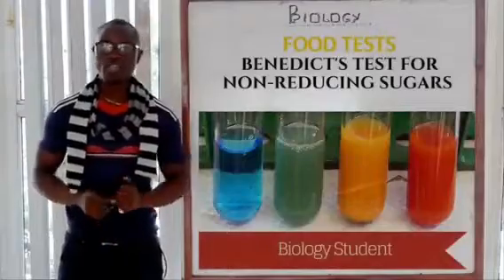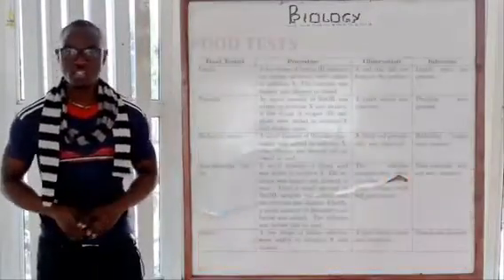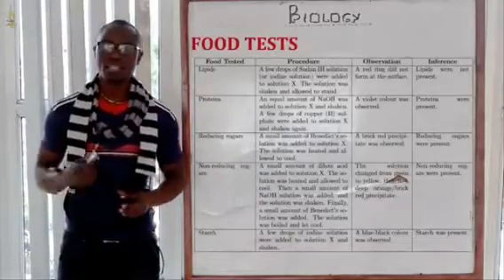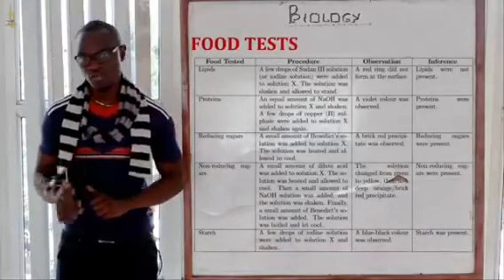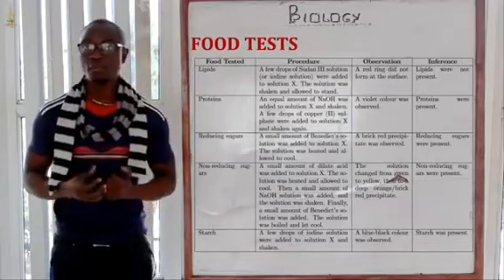Welcome again to this class, where today I want us to discuss food tests. We have different food tests, and today we are going to begin with testing for vitamin C, starch, reducing sugar, non-reducing sugar, and lipid, and protein.